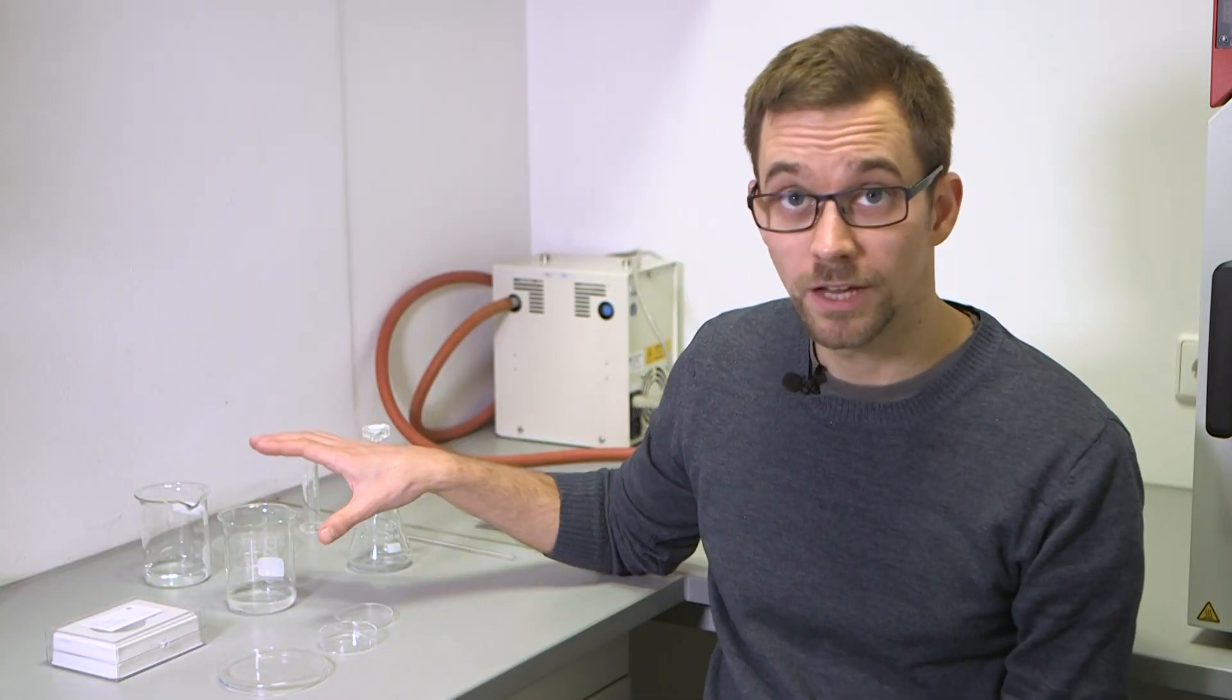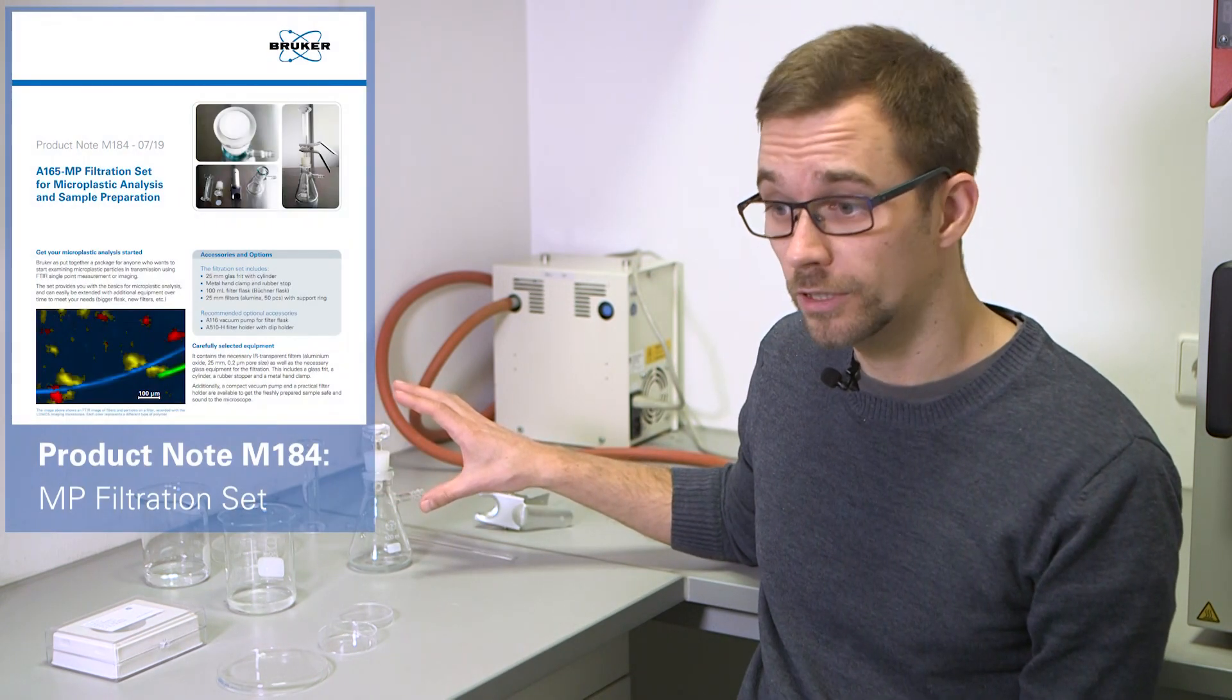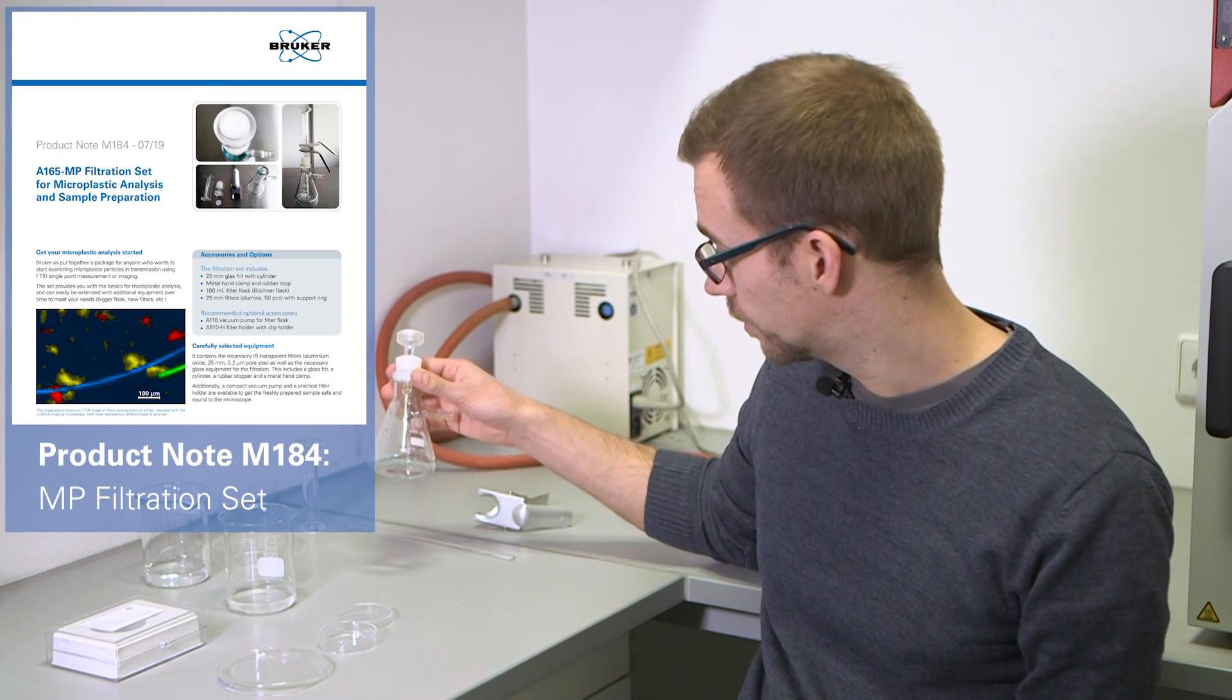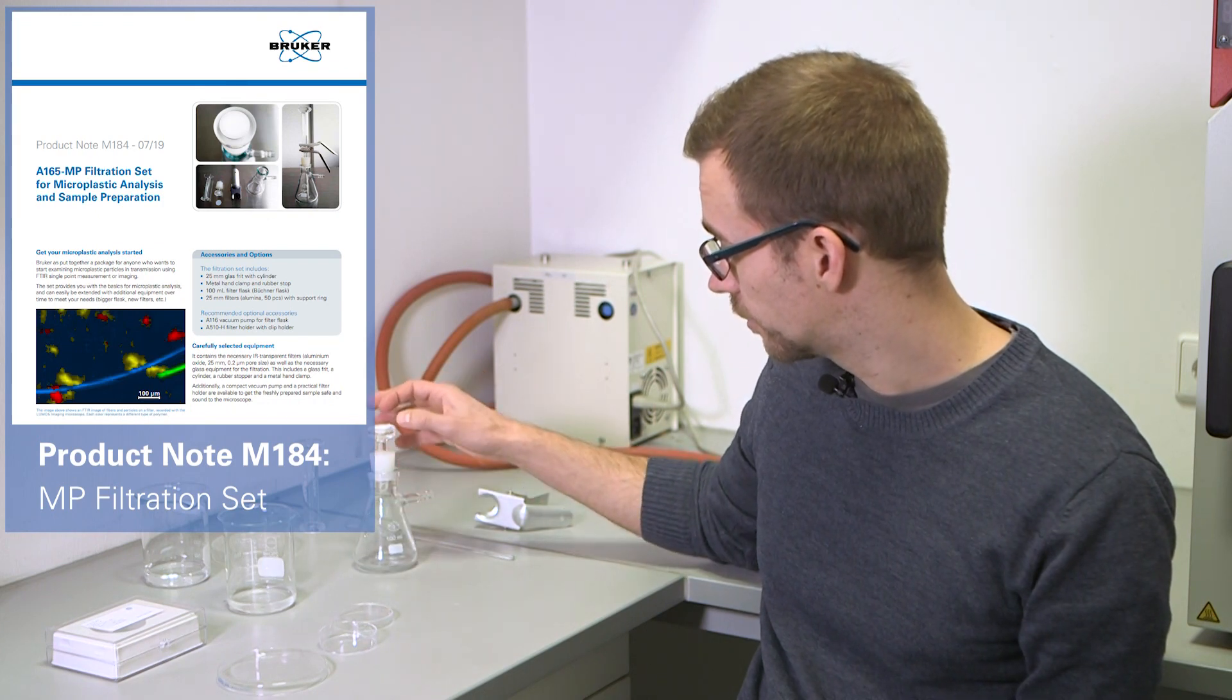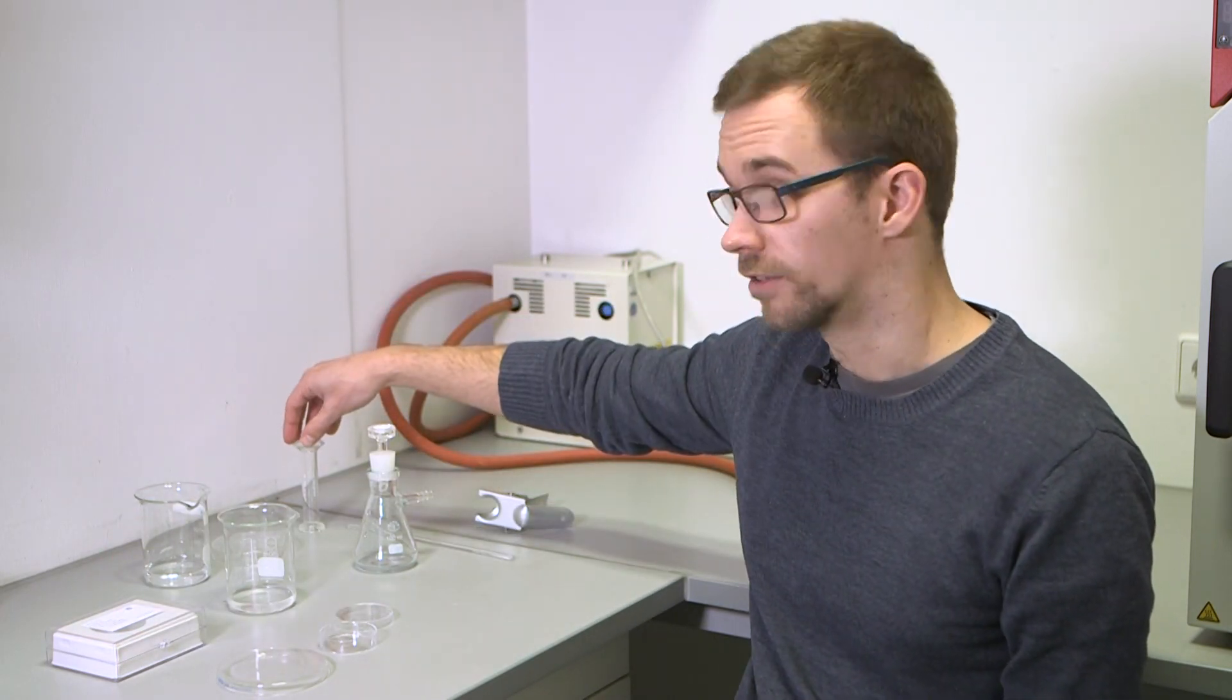So now that our sample is dissolved, we're going to filter it using this apparatus. This is offered directly from Bruker and consists of the suction flask, this rubber stop and the glass frit, a pack of filters, this clamp and the cylinder on top.